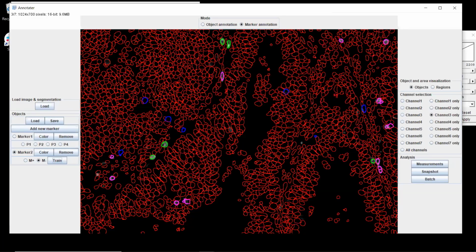You didn't do it on purpose, but you only selected large nuclei, and at the end, all the large nuclei are considered positive. In that case, it's no big deal. You just need to also identify negative nuclei that are large, for example, or positive nuclei that are small. And same thing with the shape. So generally, it works fine, but sometimes you have weird behavior. It's just because the classifier cannot converge with the features it has, and you just need to add other features. So that's how it works.